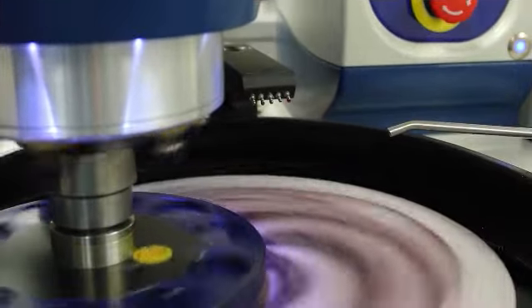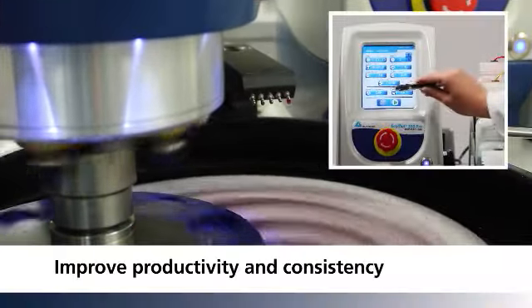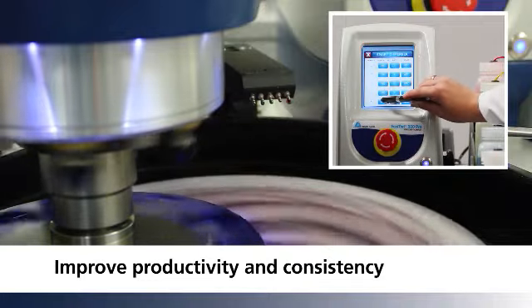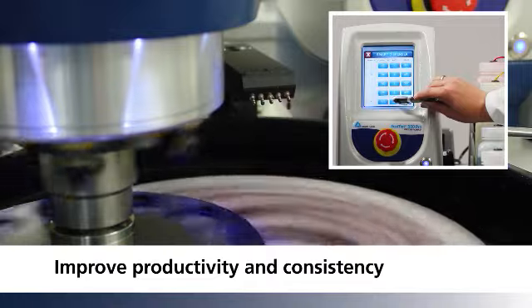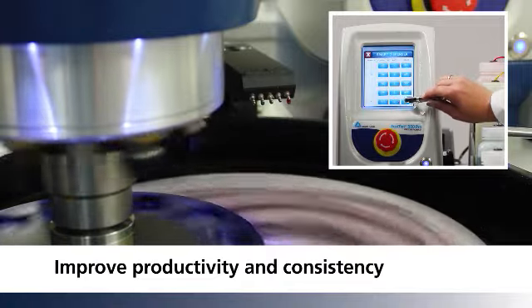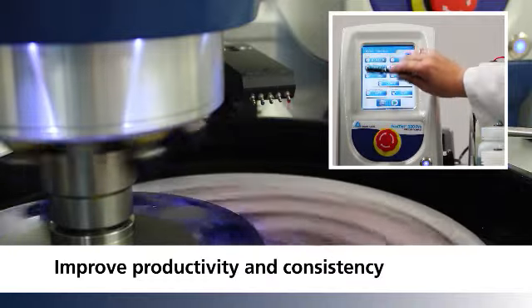The Pro model seamlessly integrates the burst dispensing system, whether you are using one burst unit or five. The burst dispensing system increases consistency, saves time, and reduces waste.